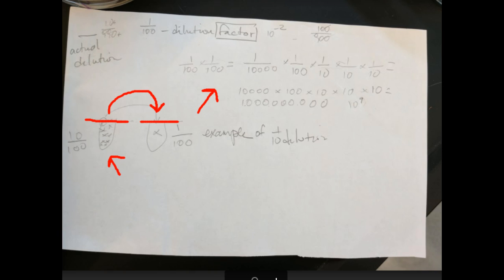As you might remember from math in high school, the basic point here is that we have a dilution factor and it's in tens. All of these here represent each one of those test tubes and each time that we mixed one into the other, the blue culture tubes.